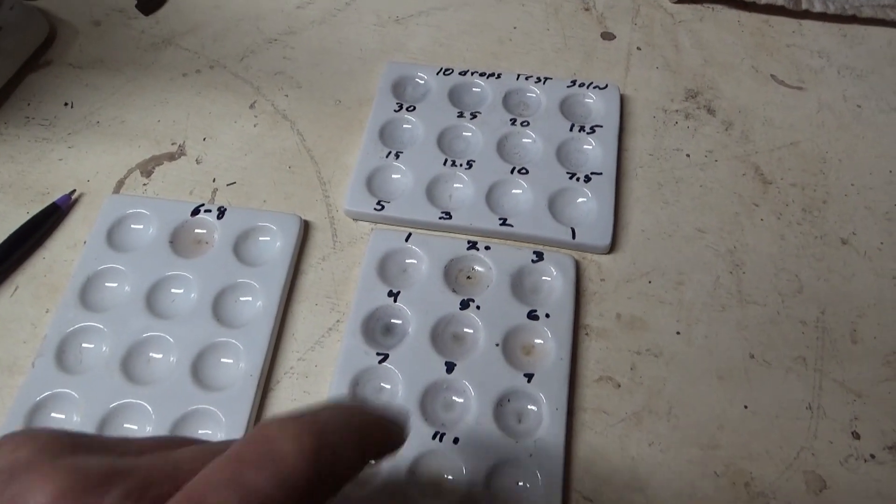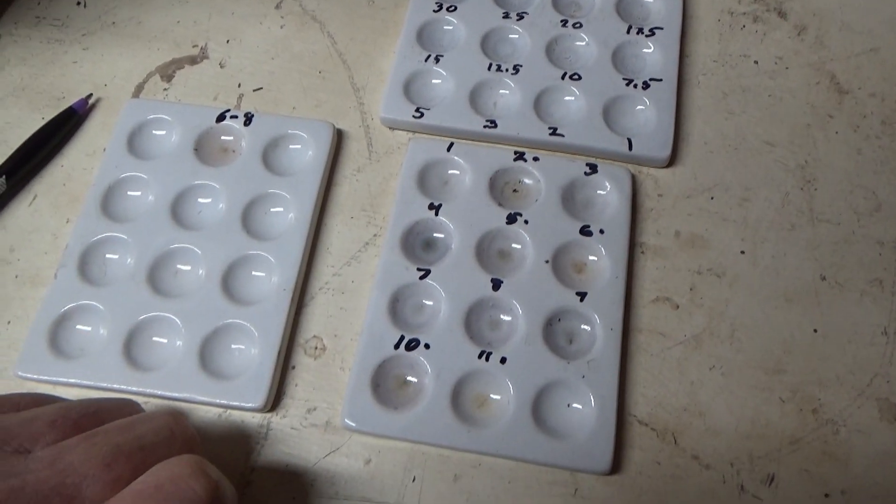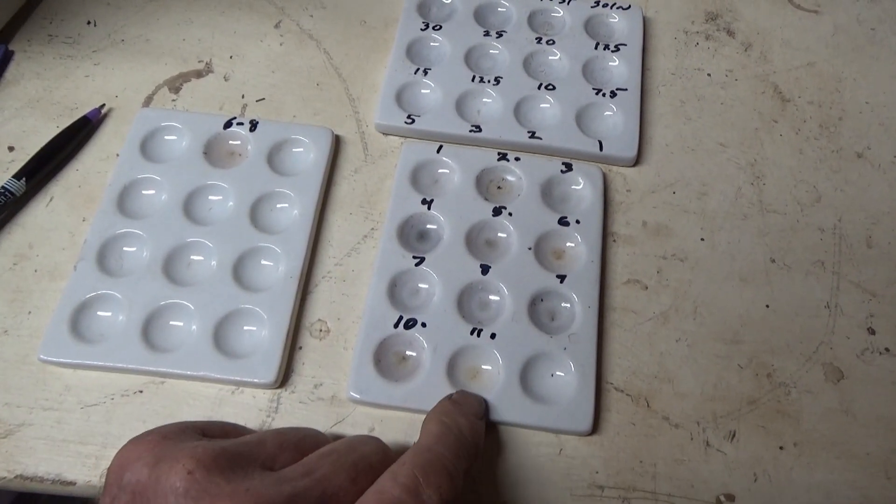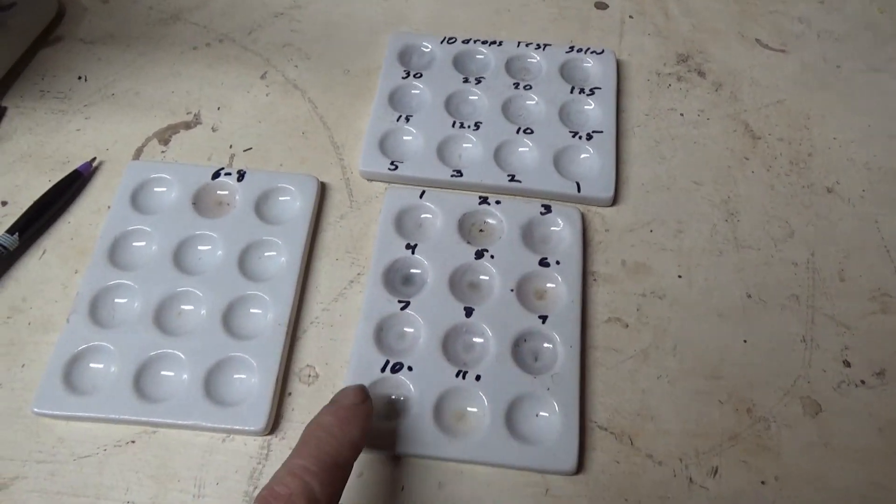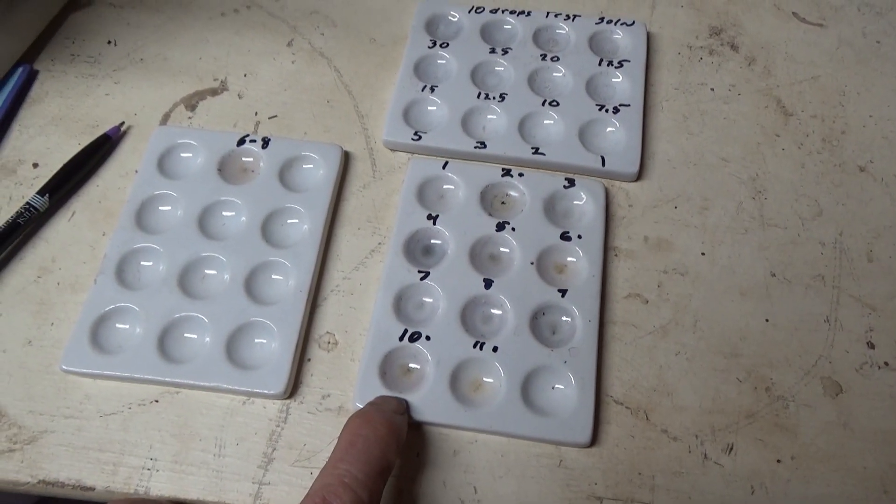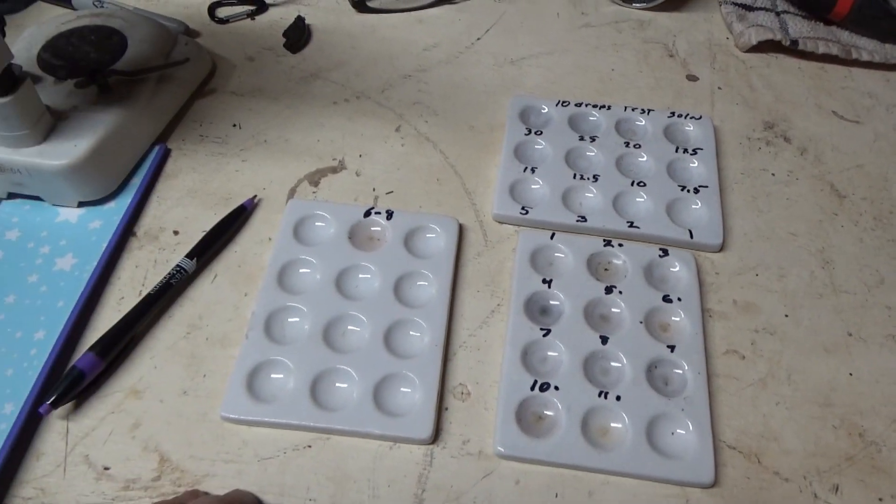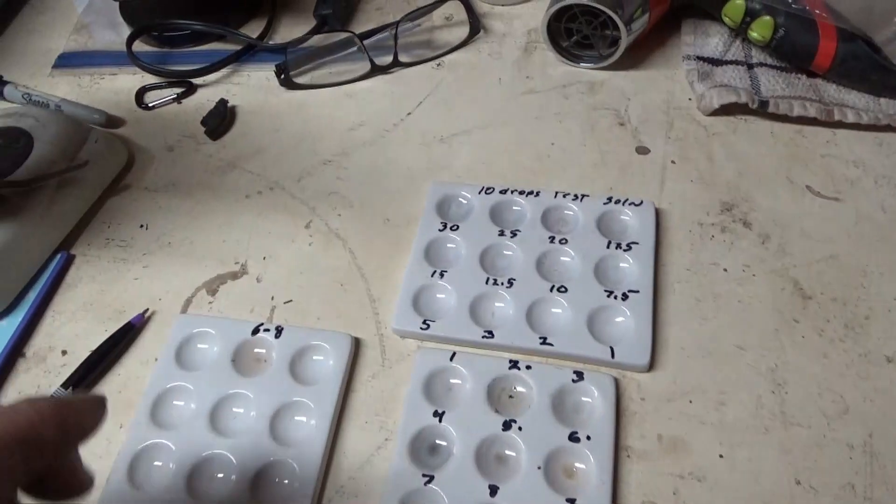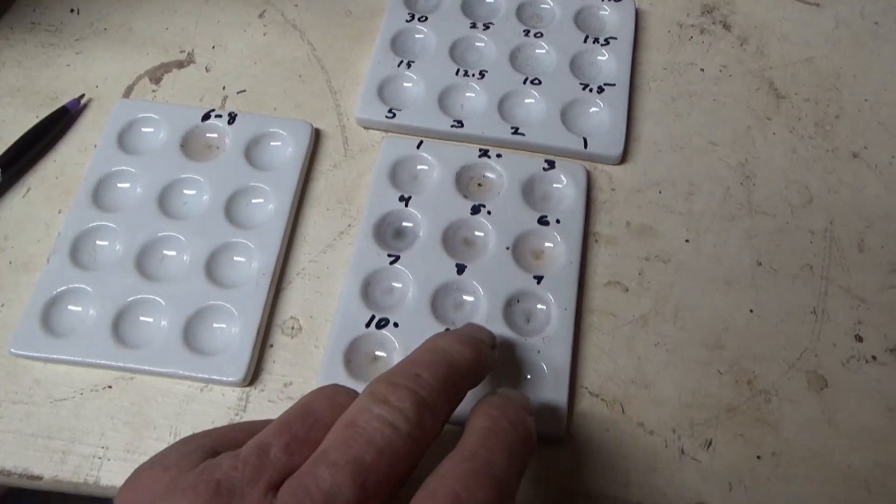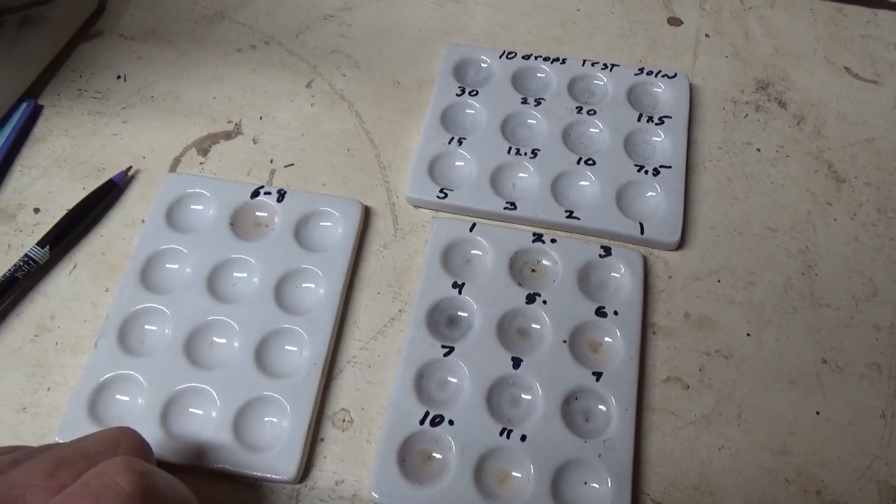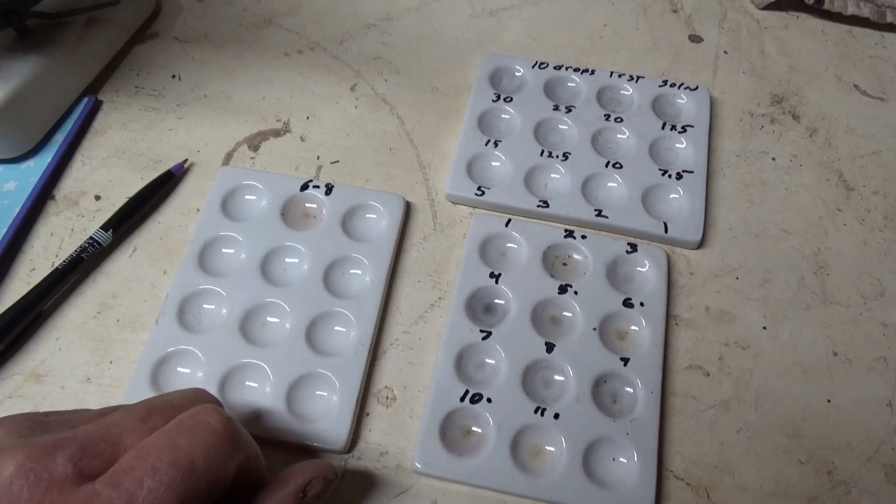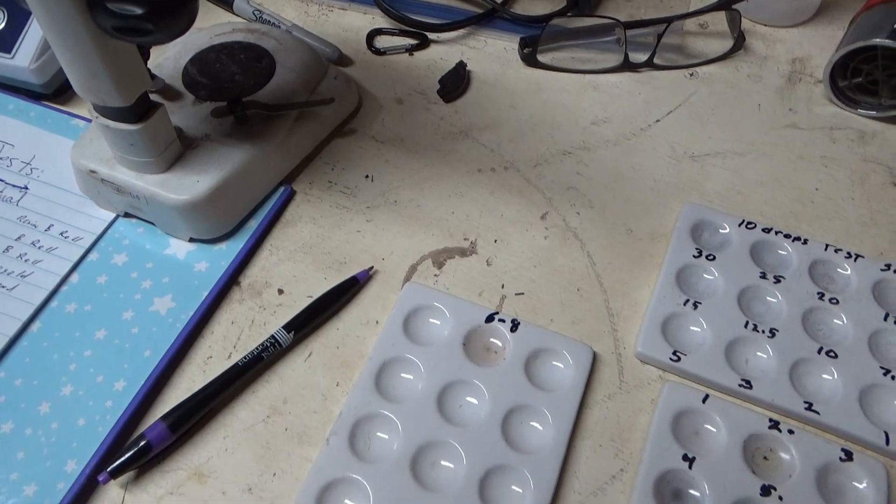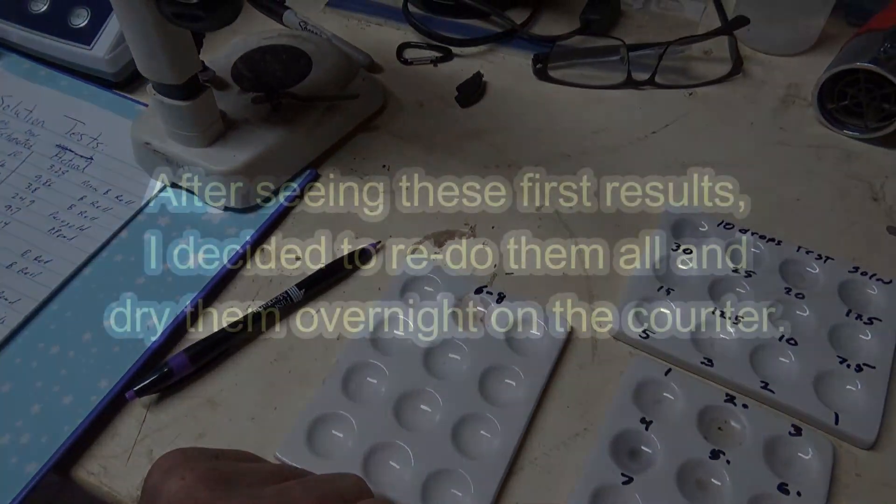Once it gets down in those ranges there, that's, you know, it should be below that when it's coming out of our resin cartridges or else we need to change the resin cartridges. It should look something more like this. So it looks like our limit of sensitivity is where we need it, although it looks like we may want to make a new standard sheet that we blow dry, or we make sure we run our tests here just countertop dry them. And this sample here that we took today is kind of where we expect it to be, so that's good.